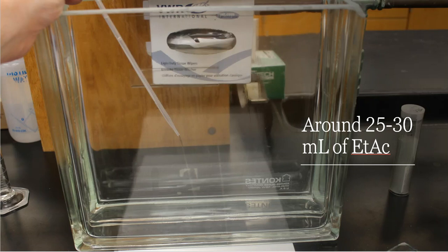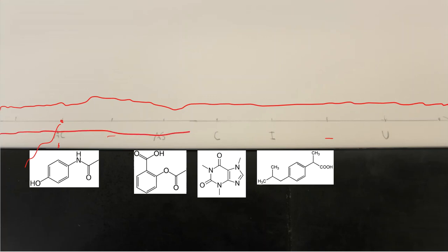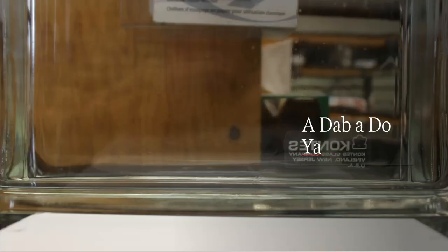So you don't want to overfill it. If you overfill it, what will happen is that your solvent will go above this line. And if your solvent goes above this line in the very beginning, then it's going to take these components that you spotted, and these components are just going to fall out of the plate. They're not going to be pushed up the plate, and that's what you need. So when you put the plates down in here, you want to make sure that that solvent doesn't really touch that line that you have spotted your components on. You want the movement to push those components up the plate, and you don't want it to dissolve out in solution because of that. So that's the number one concern that I always have when people begin to start a TLC chamber.